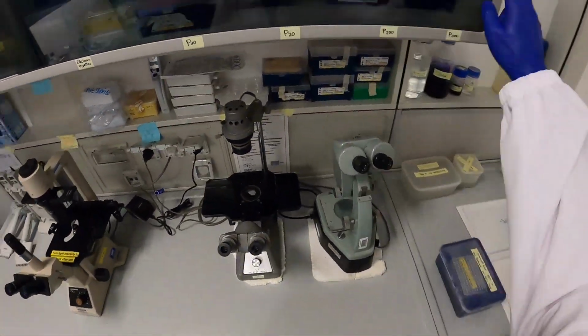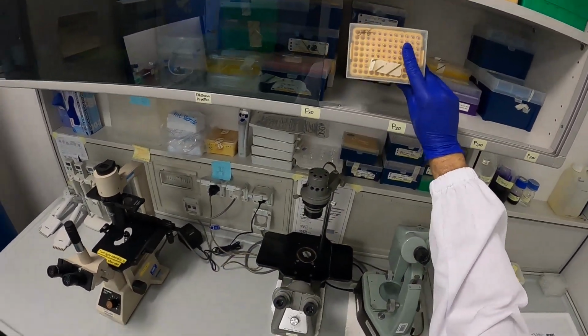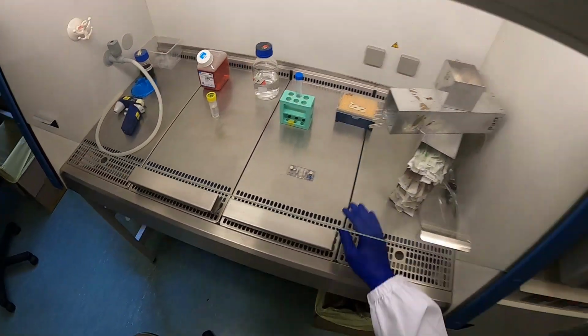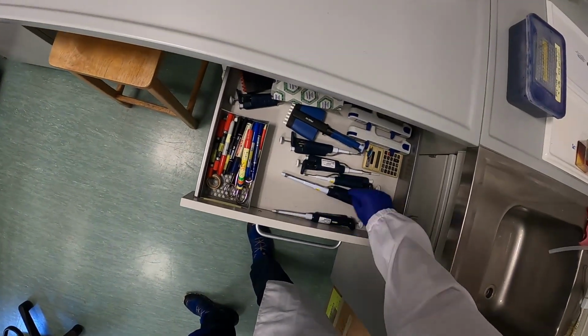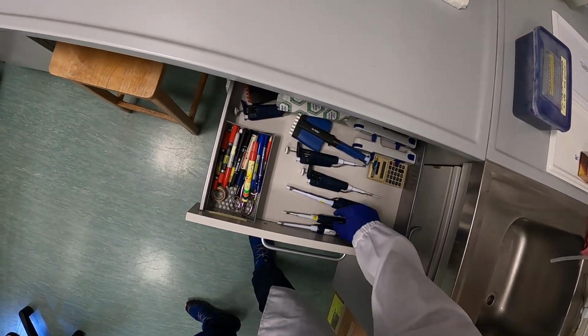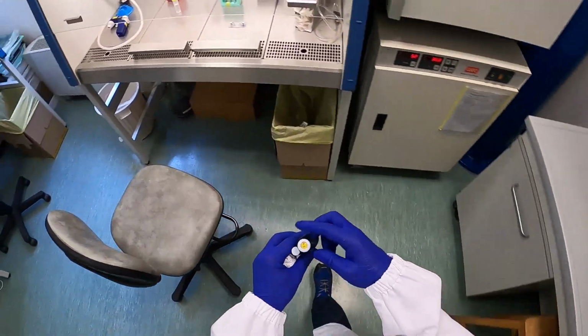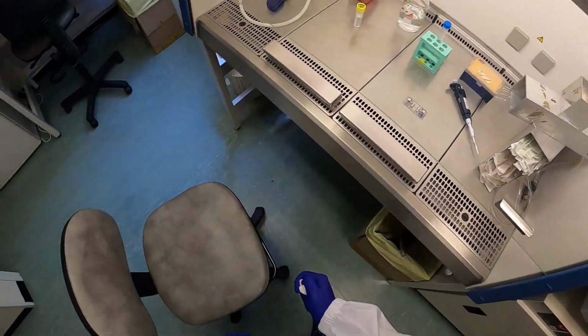Okay, and then we need to introduce a small volume of cell suspension in the hemocytometer. So we use the P20, those are the tips. We use a Gilson pipette which we call the P20 because it's 2 to 20 microliters, but there are also other pipettes in there with other volume ranges. And that's it, we're ready.